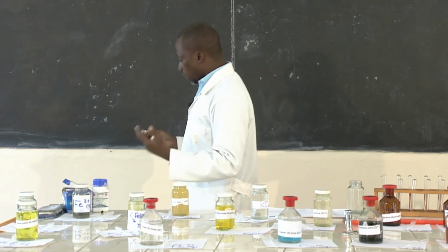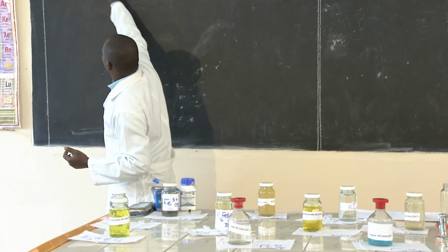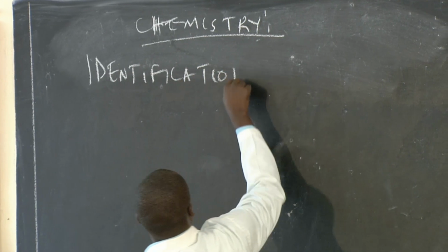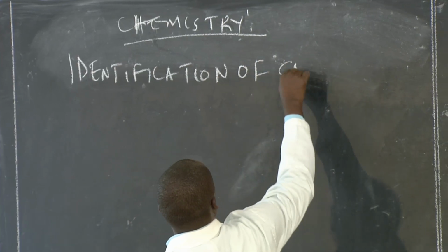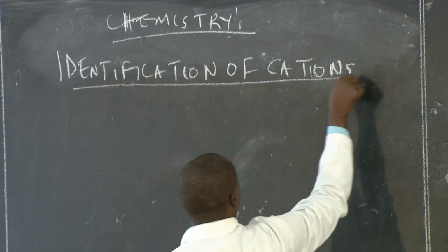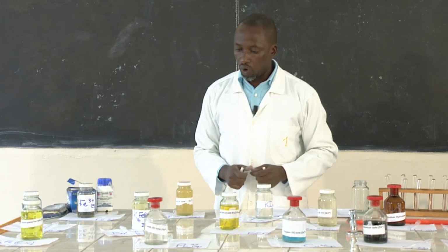So here we'll be looking at the identification of cations. And we have a number of cations, as I've mentioned before.